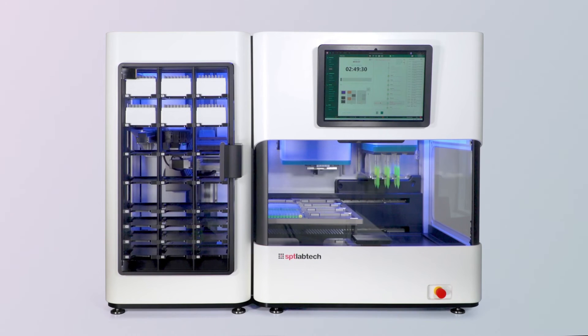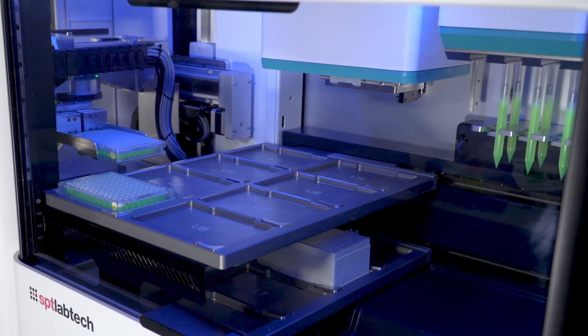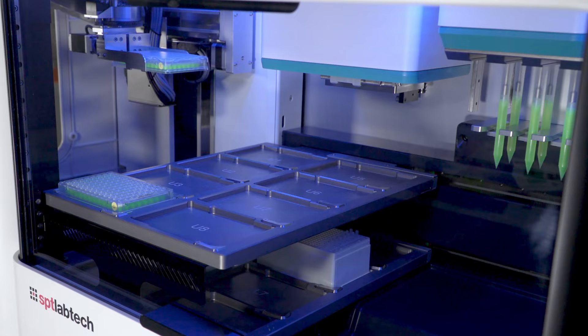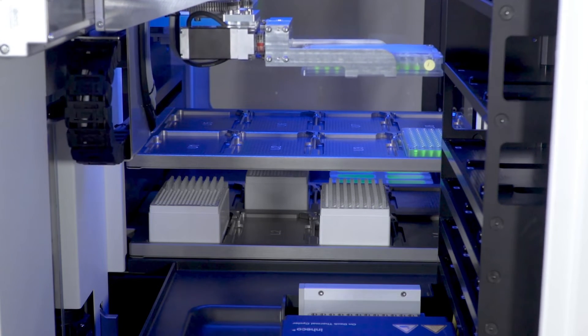You can hear the lid of the thermocycler being opened in preparation for receiving the plate. The plate with the lid on is being picked by the gripper from the expansion module and will be moved onto the thermocycler. The thermocycler is the industry gold standard Inheco thermocycler with an automated lid.